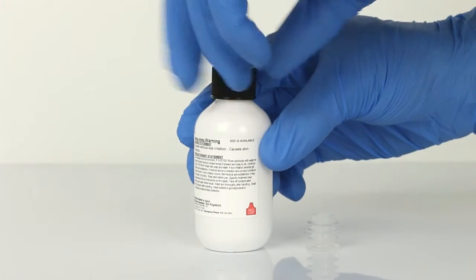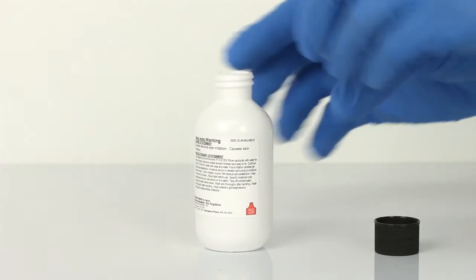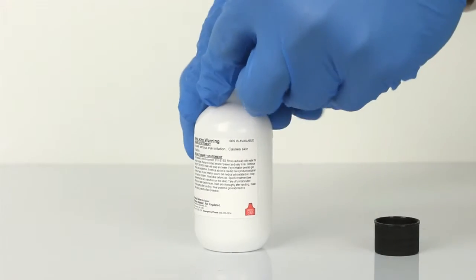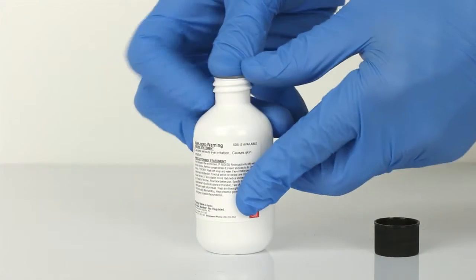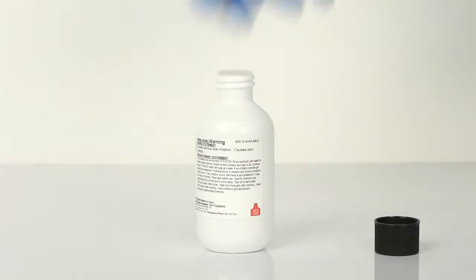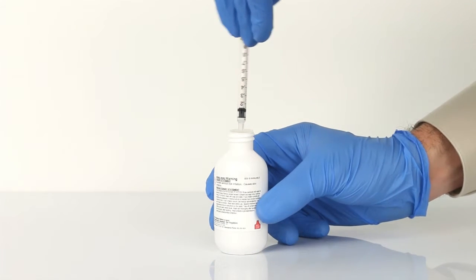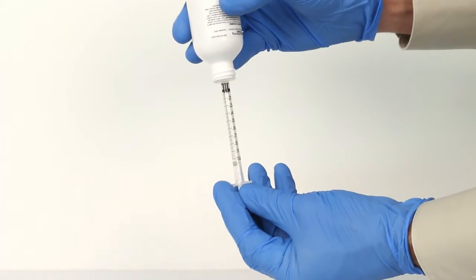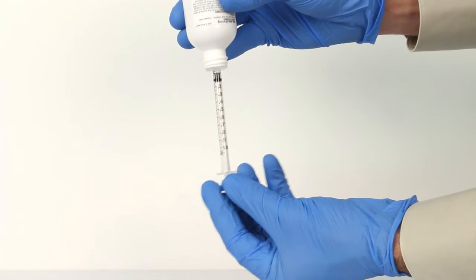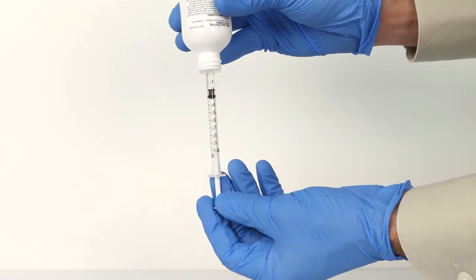Next, put the orifice reducer into the chloride bonding reagent number 2. Insert the syringe through the orifice and turn the bottle upside down. Plunge the syringe a few times to remove any air bubbles, and then take 1 ml of the reagent.